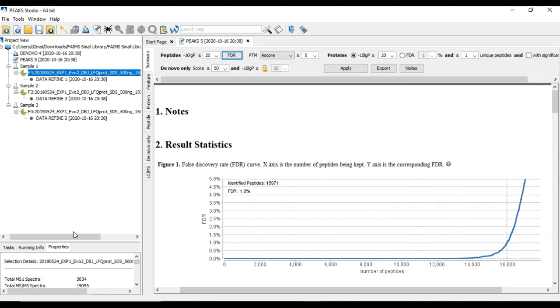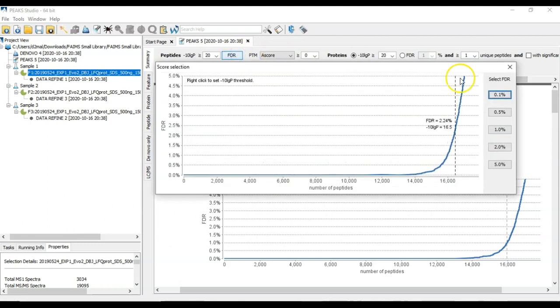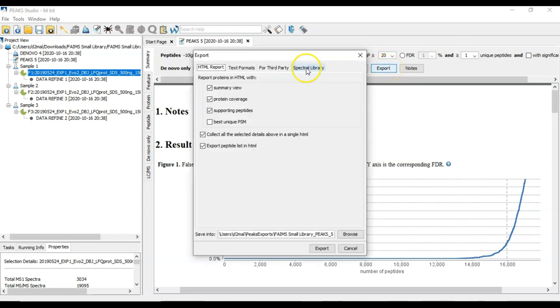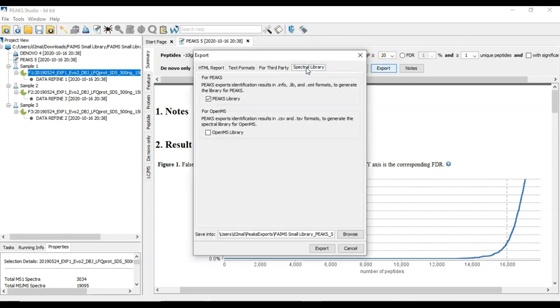To do that, you come here to the identification result, select an FDR cutoff, and then apply that. Then you can export a library by just going to Export, Inspector Library, and it will create a spectra library for you with this button.